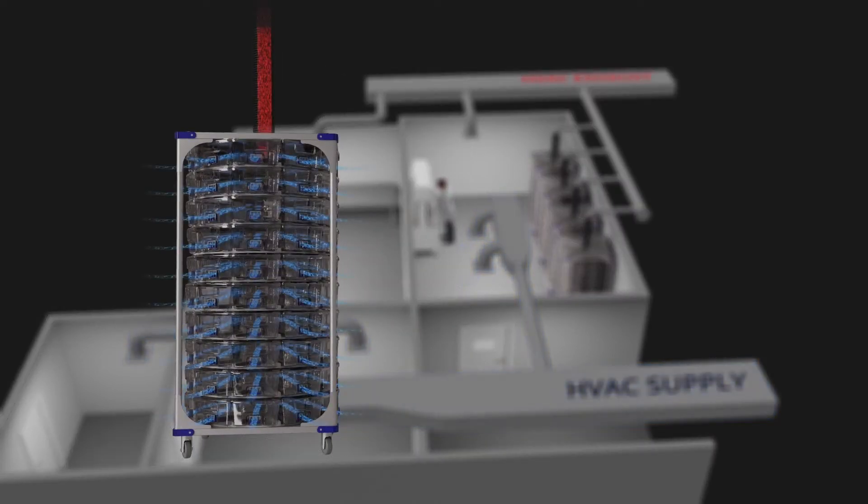Here is a close-up look of the Animal Care System's rack and how the air travels into the rack and cages.